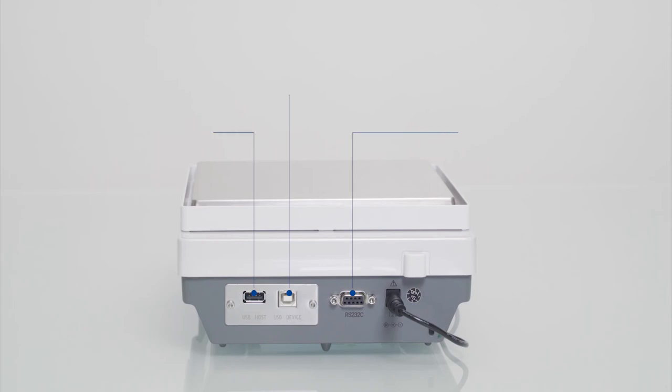The MET features three interfaces on the back of the balance which support barcode reader, printer and PC connections for simple data handling and easy transfer to your PC or printer.